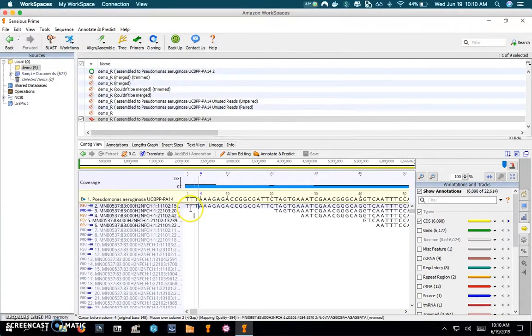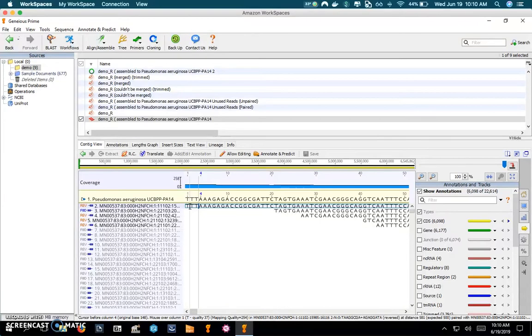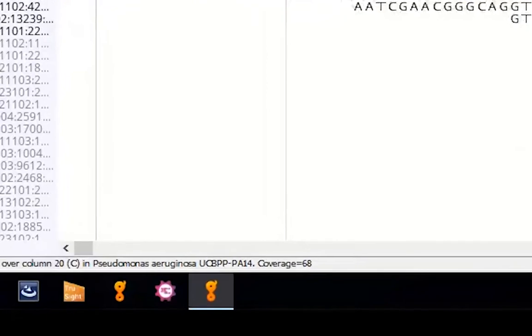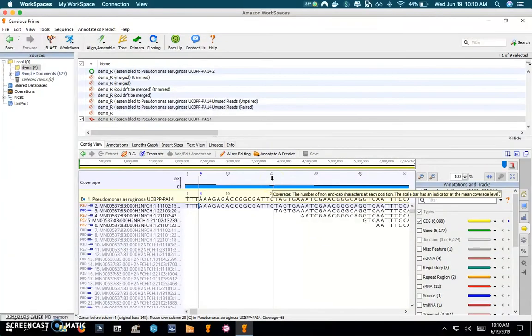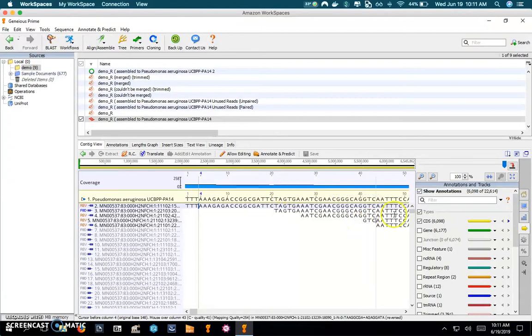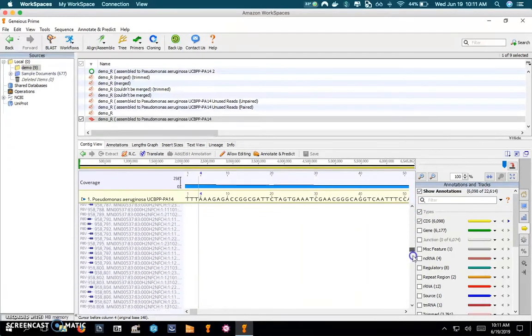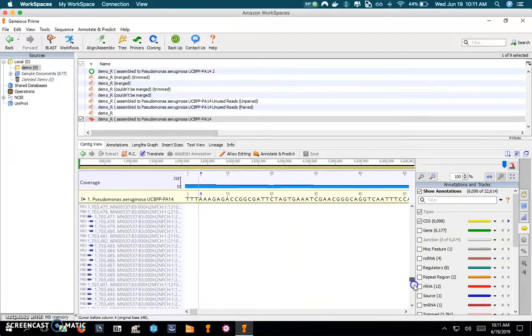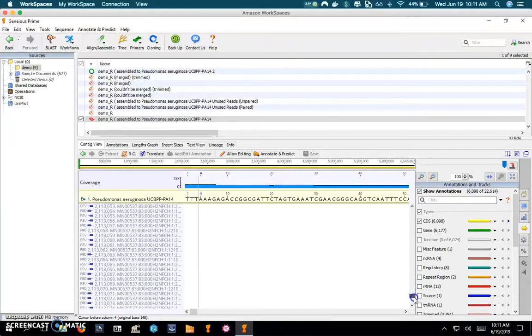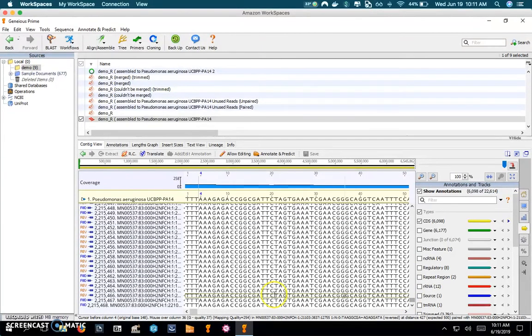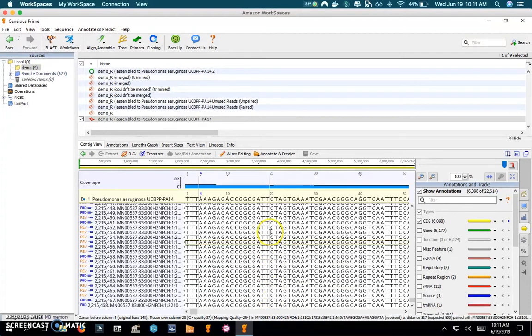So that means it's 78x coverage at the first locus. I think we have to go over roughly here, you see the coverage in the bottom changes to 68, so the coverage goes down just a little bit there. And I'll bet if we scroll down here we'll probably find some other mapped reads somewhere, and here they are.